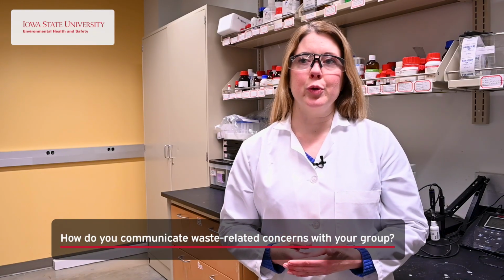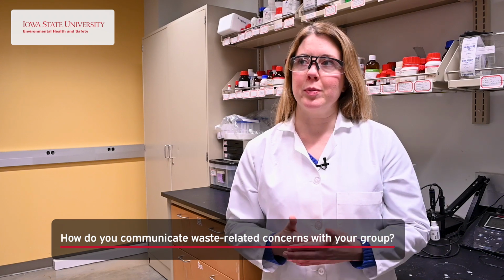When I need to communicate waste-related issues with my group, the first and most important piece is making sure it's communicated promptly and that everyone hears about it. So I usually do that through 2 channels. One is we have a group Slack channel where I can send out a message to everyone, but also we have a weekly group meeting, and that's a really great time to talk with everyone in person to make sure that everyone's on the same page.